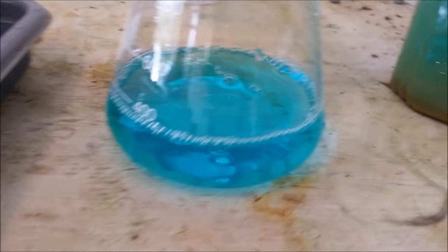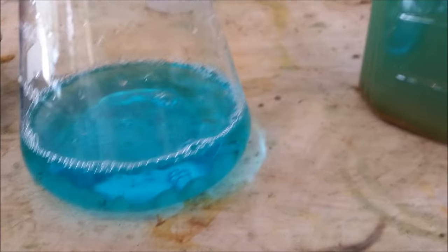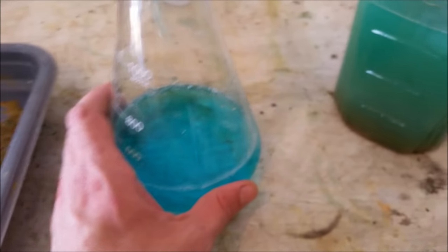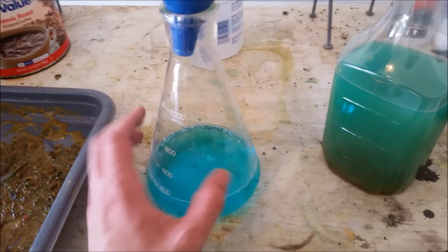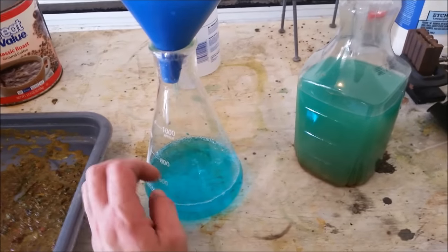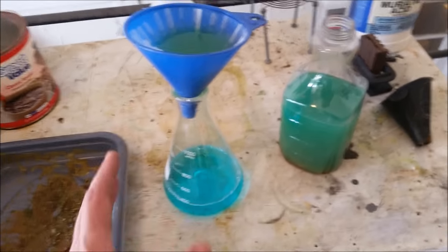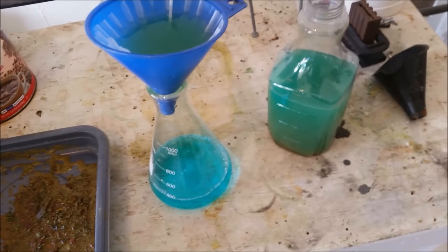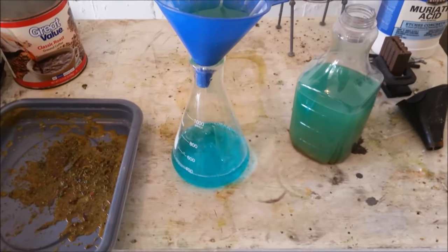Now that I've gotten about 375 milliliters in there, you can see the difference that a couple of cotton balls can make when you're trying to filter it. Once this is done, this will be ready to crystallize. I'll probably purify it a bit more during the crystallization — you essentially just dry it out, and when you still have a few milliliters of liquid left, you pour that off. Then it should be pure enough that I can start using it again to grow more crystals.